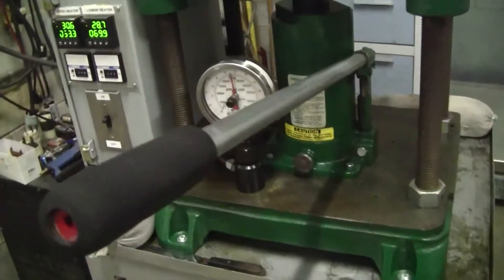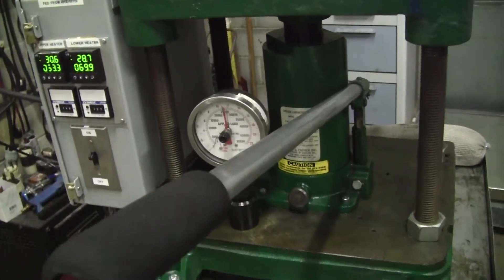This particular press goes up to 25 tons — that's 50,000 pounds.